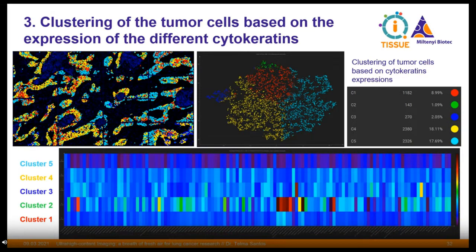So here, what I did was a k-means clustering of the tumor cells only, in the hope of getting some interesting clusters to identify and maybe define new subtypes of the cancer, of the tumor cells. And basically after plotting it, I also did a t-SNE plot. These kinds of plots help you have an overview of how the cells are organized in relation to each other.